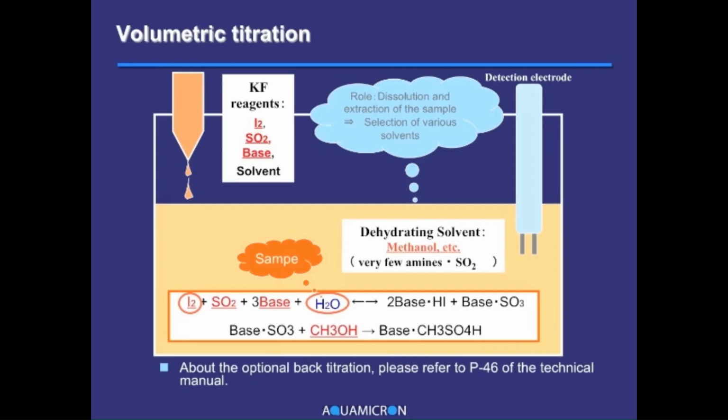First, the analyzer for volumetric titration is an automated instrument based on the original glass analyzer that Dr. Karl Fischer formerly assembled himself. The main compartment is a sealed glass flask which contains methanol as a solvent for samples, and it has a detection electrode inside to detect the oxidation-reduction potential of the inner solution. It is attached also to a glass burette filled with the Karl Fischer reagent for titration, and the titration operation is done manually. In the volumetric titration analyzer nowadays, the titration procedure is automated.